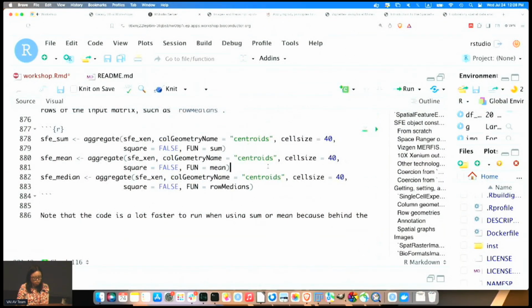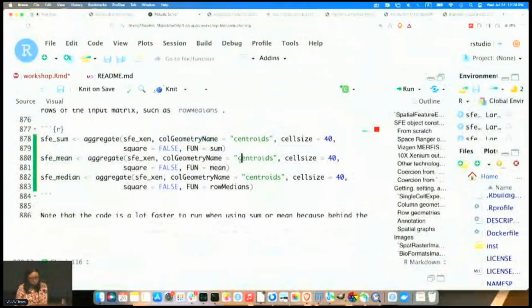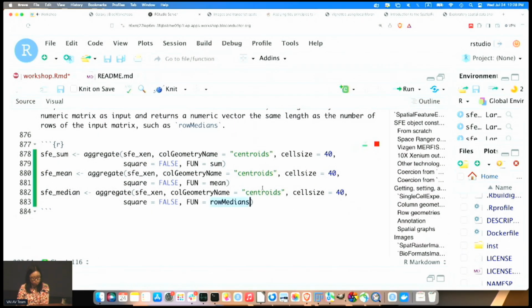So that was for transcript level, which I personally think is more appropriate. But SFE raster will do the aggregation at the cell level, and we can also do that here with the aggregate function, which uses colGeometryName instead of rowGeometryName. At cell level, we already have the gene expression data, and we can use different functions to aggregate those, like sum or mean or any other function.